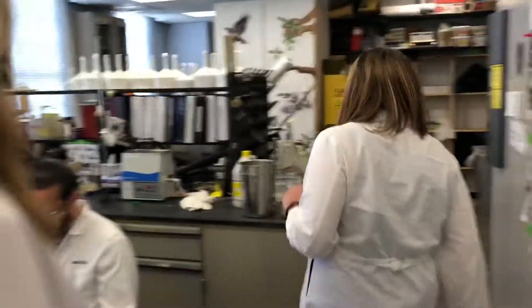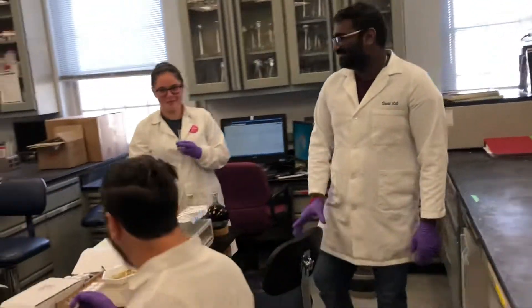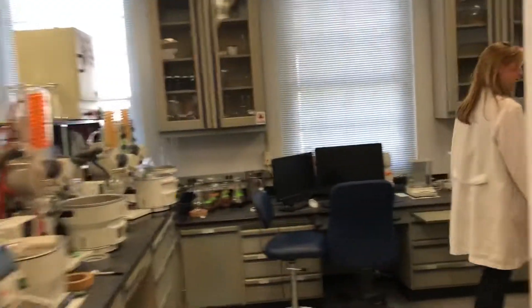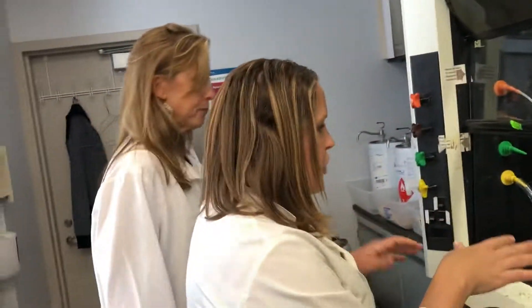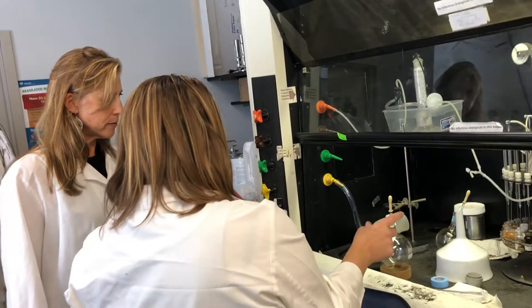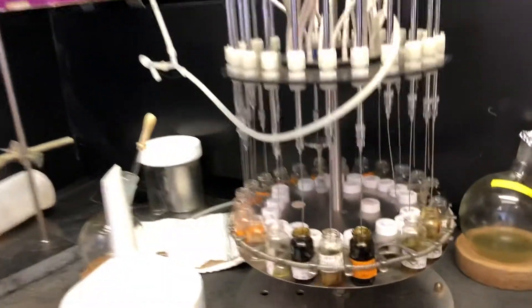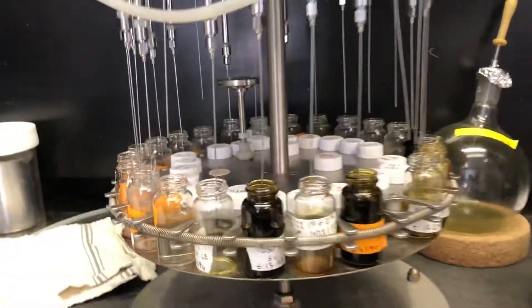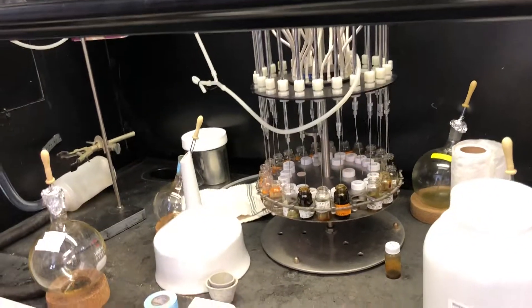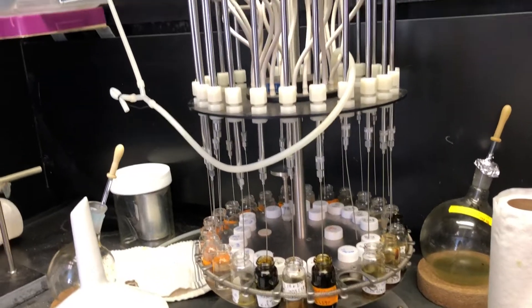This is our chemical safety hood and one of our drying apparatuses. We basically took that liquid and it's just blowing air onto the vials of liquid, so eventually they evaporate off. That's where you get the last little bits of stuff. It can take about a day or so, depending on how much liquid is in there.